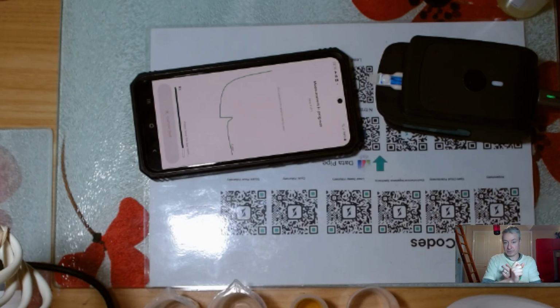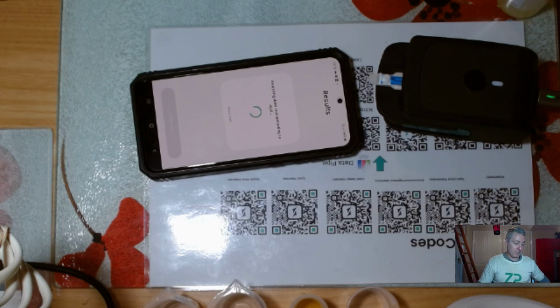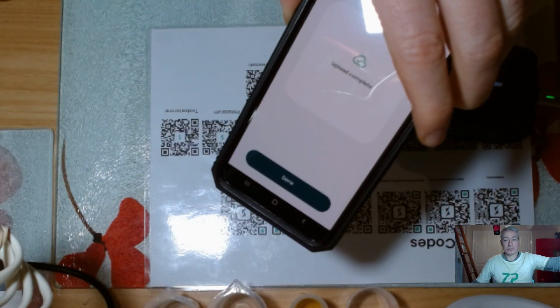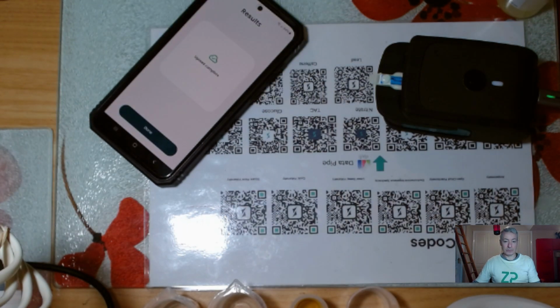So you don't need to go off and necessarily develop new electrodes. You don't have to go off and develop potentiostats. That's done. So people would spend 2 years getting to that stage. The next stage is make the assay better, make it reliable, make it reproducible, make the user experience good. But fundamentally, that is the detection of peracetic acid in milk. And then it says on my little screen, upload complete.